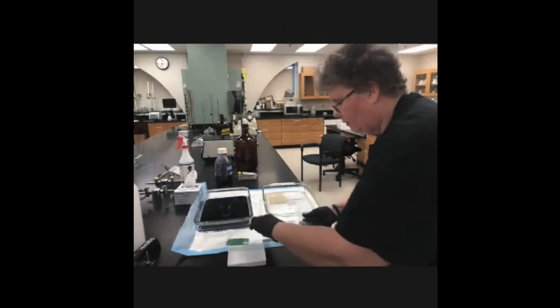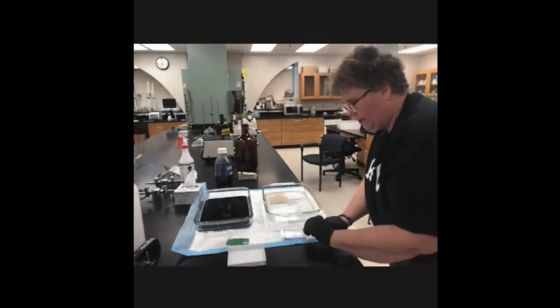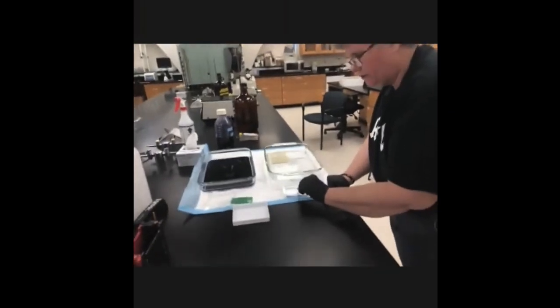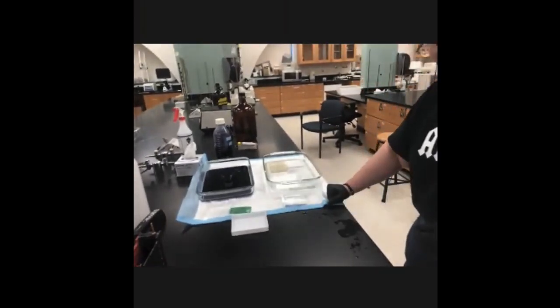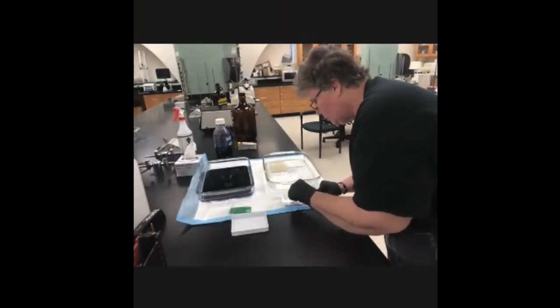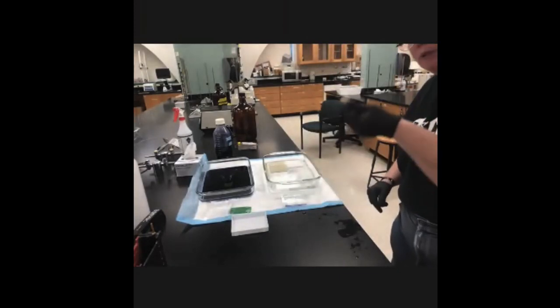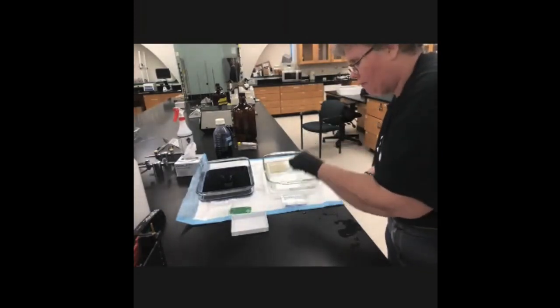Now, we have to separate the two halves. Remember, we loaded S1, S2, S3, S4, marker, S1, S2, S3, S4, marker. Now we need to separate the two halves of the gel. So we're going to go down with a razor blade, and we're not going to drag the razor blade. We're going to go chop, chop, chop.